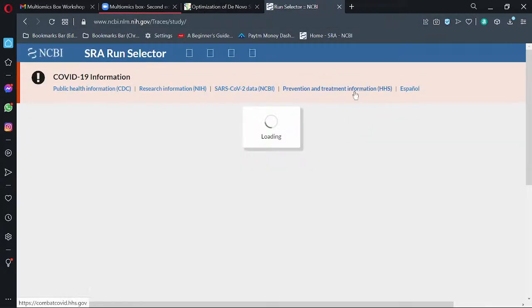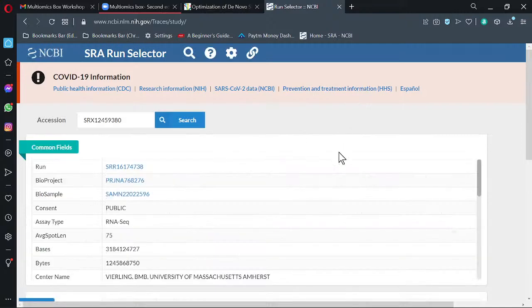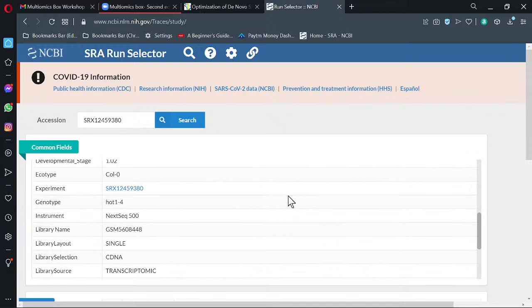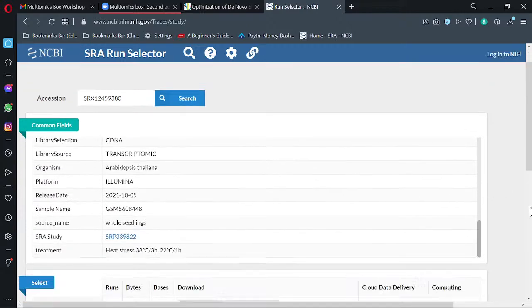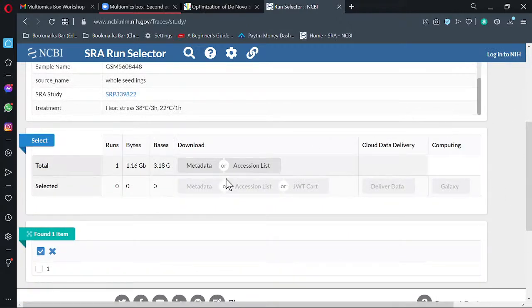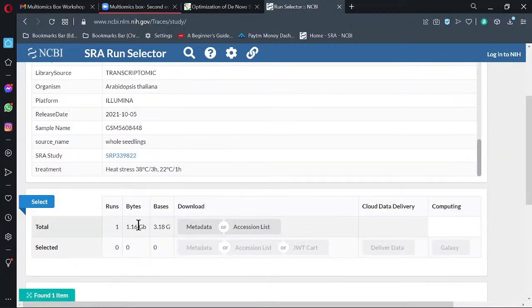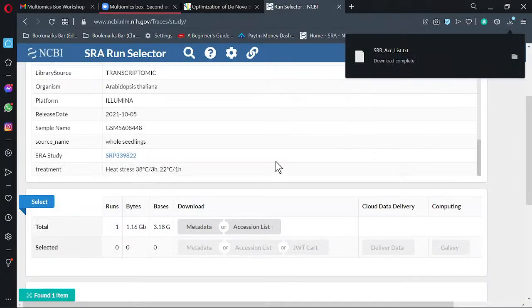Suppose you have a big text file and you are searching for a word in it, it will take a while. But if you have small files, you can quickly search them, or see where it maps, where it aligns. So indexing the reference genome is to break down the whole genome into smaller files so that the process is fast and quick. Okay.